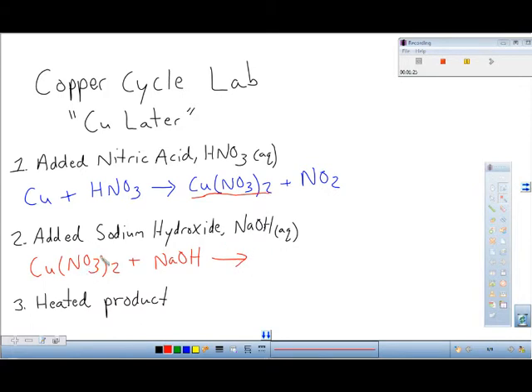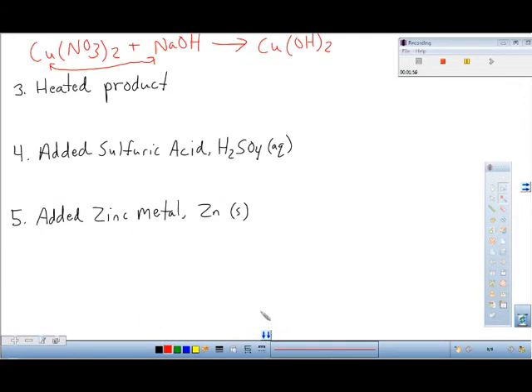This produced a second chemical reaction where copper and sodium switched places - the Cu combined with the OH to produce copper hydroxide, Cu(OH)2, which turned the color even more blue. We also got sodium nitrate, but we're not concerned about that. That was the second step.